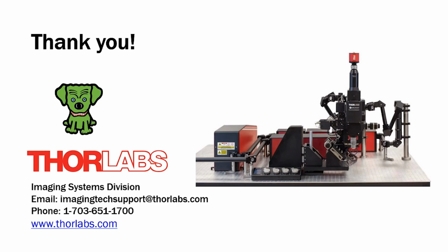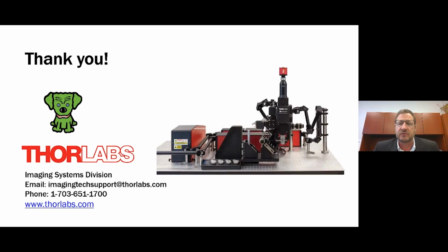Do the different XCaMP fluorophores, the GCaMP and RCaMP, have different FLIM lifetimes as well as the intensity changes? Yeah, I'll take that question. My understanding is there are different FLIM lifetimes for the different XCaMPs, and they can be mixed together, and it allows you to do some separation in the image.